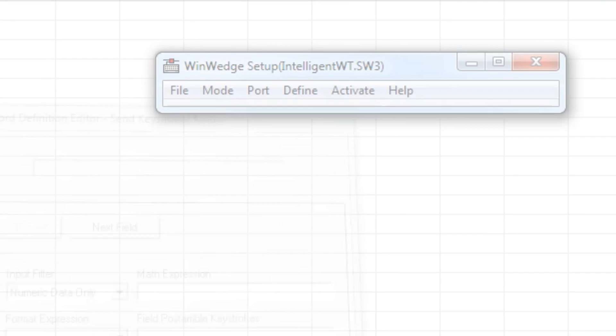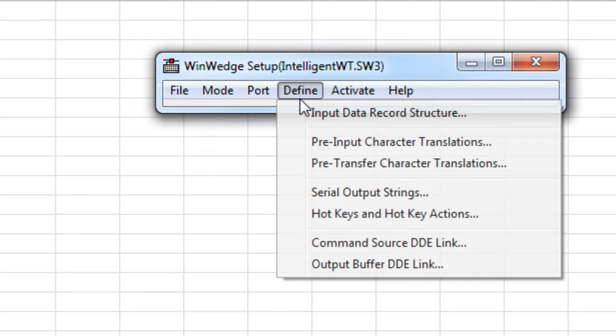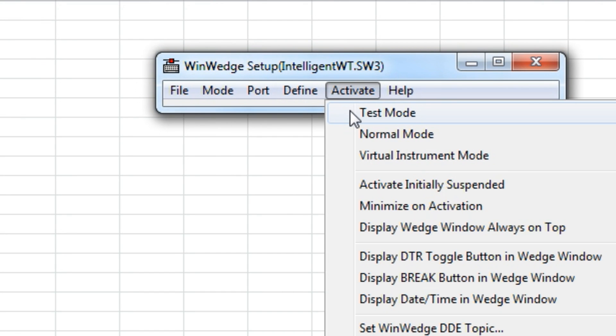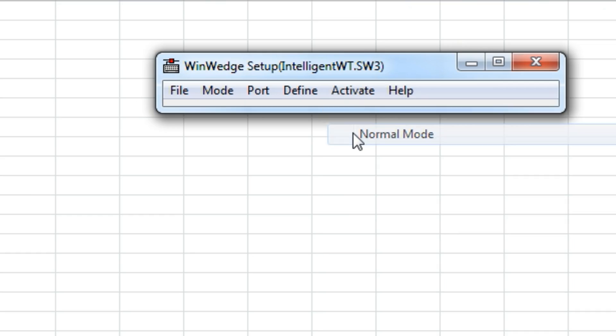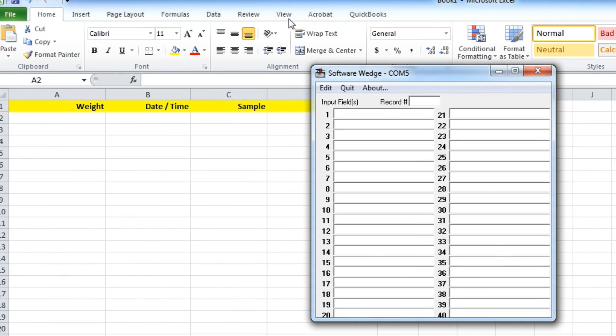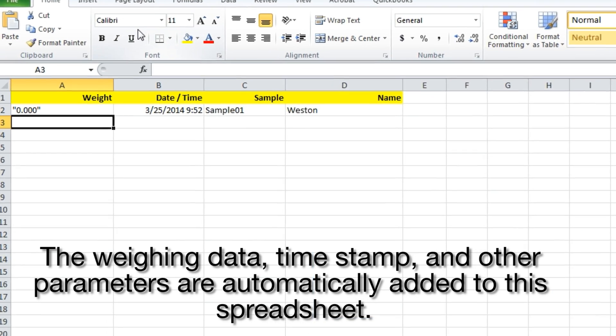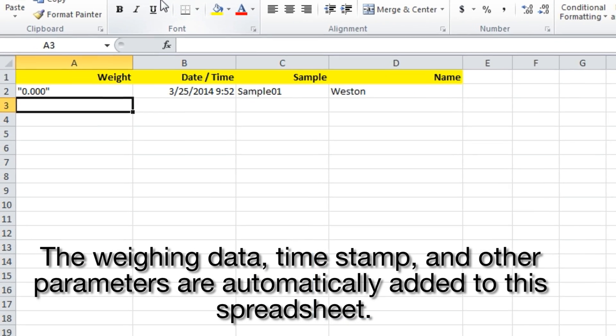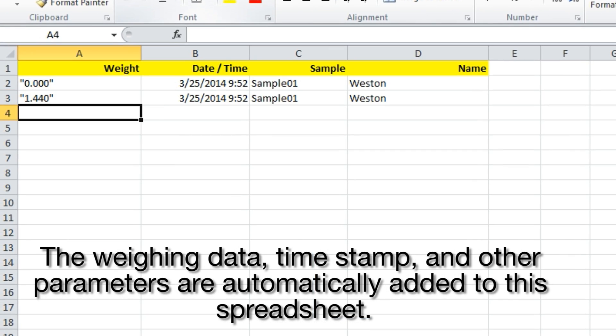You are now ready to transfer your weighing data easily and automatically to Windows-based applications like Word, Excel, or even OpenOffice.